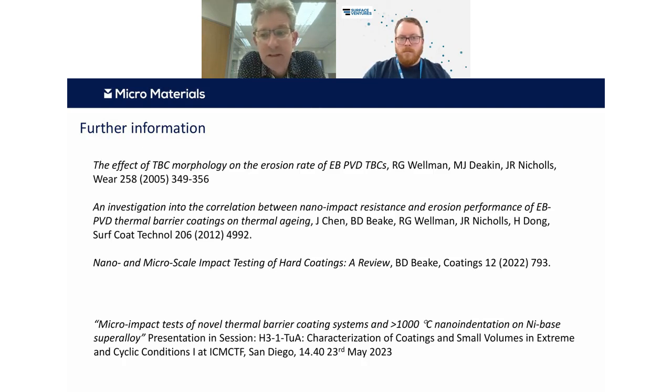But in general, yeah, this is a very flexible test method. It can potentially work on just about anything, really, because you can tune your test conditions. You can tune your load, your accelerating distance, and your probe geometry to suit whatever type of material you're looking at, essentially.